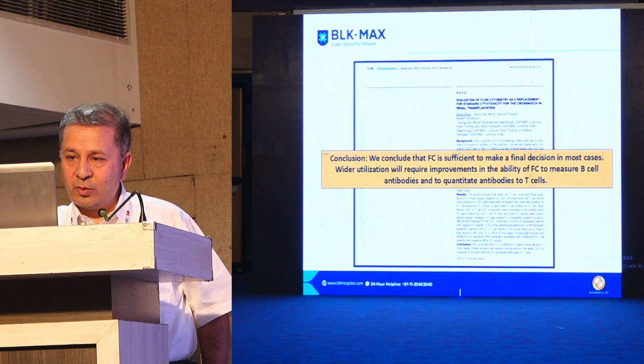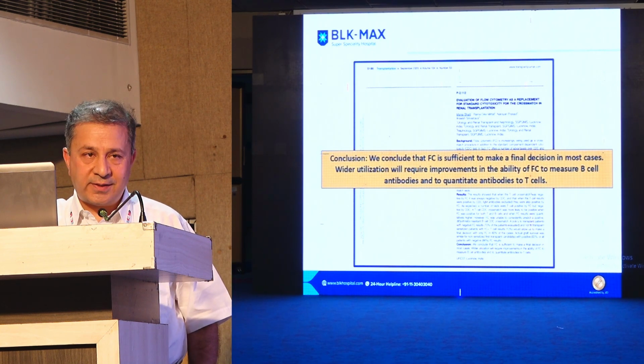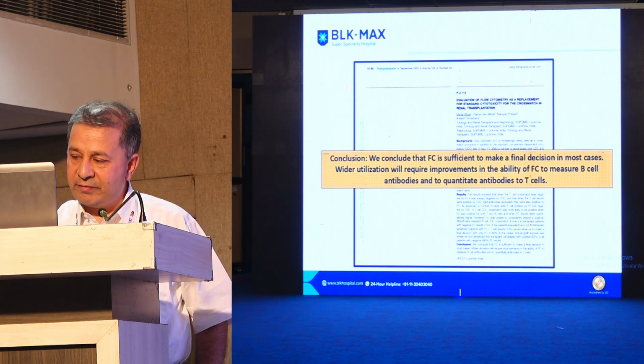And this is what I would like to conclude. The flow cytometry is sufficient to make a final decision in most of the cases, and this is not my center's study. This is a study from another center in the country, from SGPGI, where it's very clearly showing that it's able to identify most of the stuff very, very well.